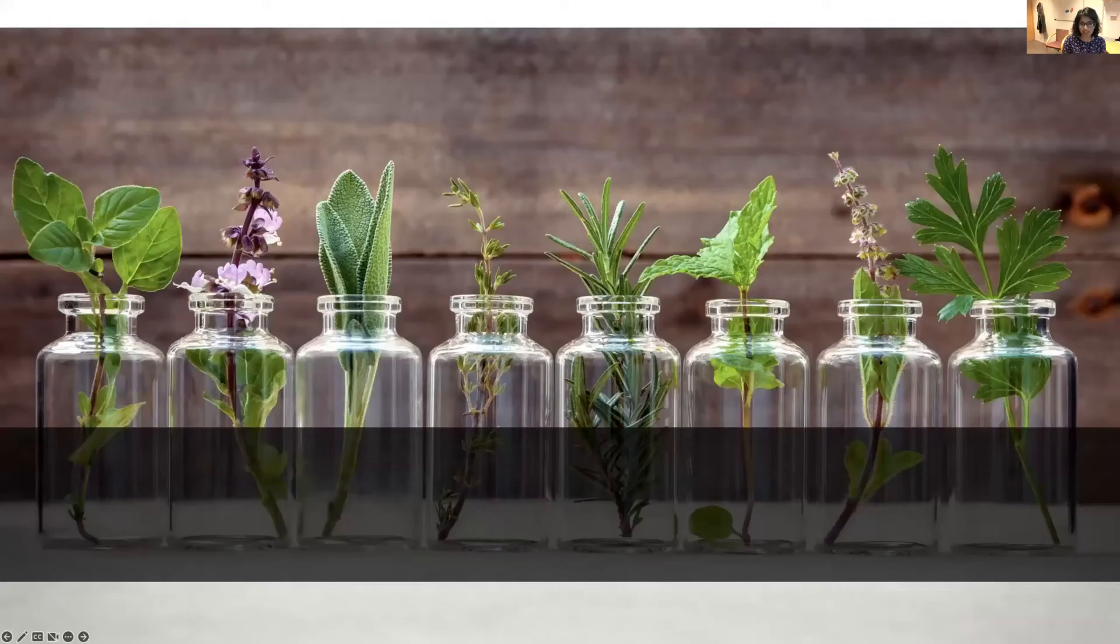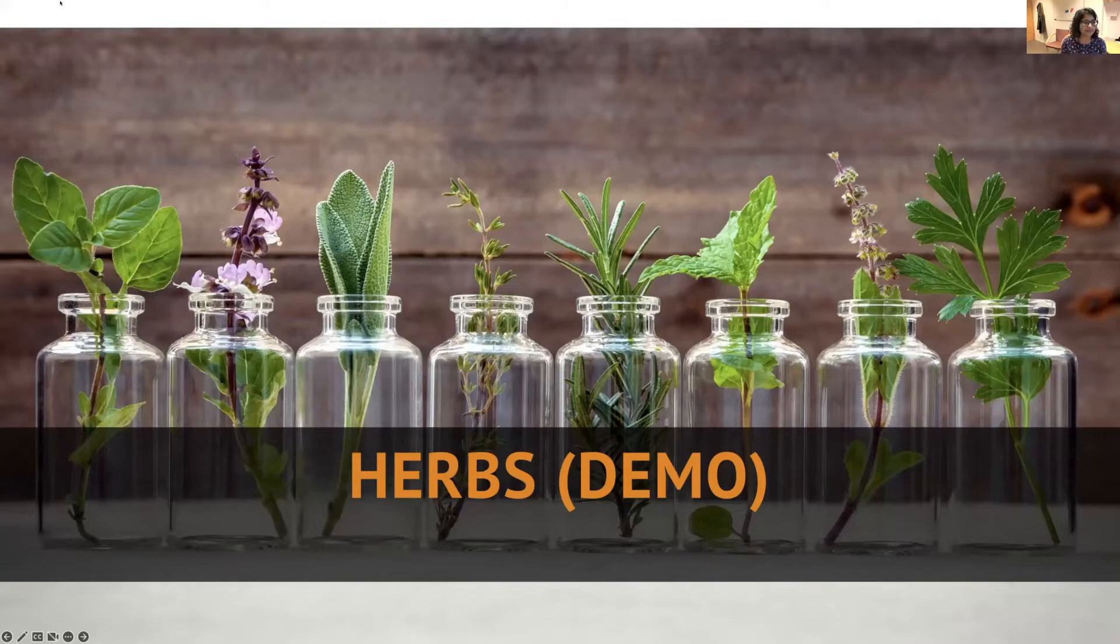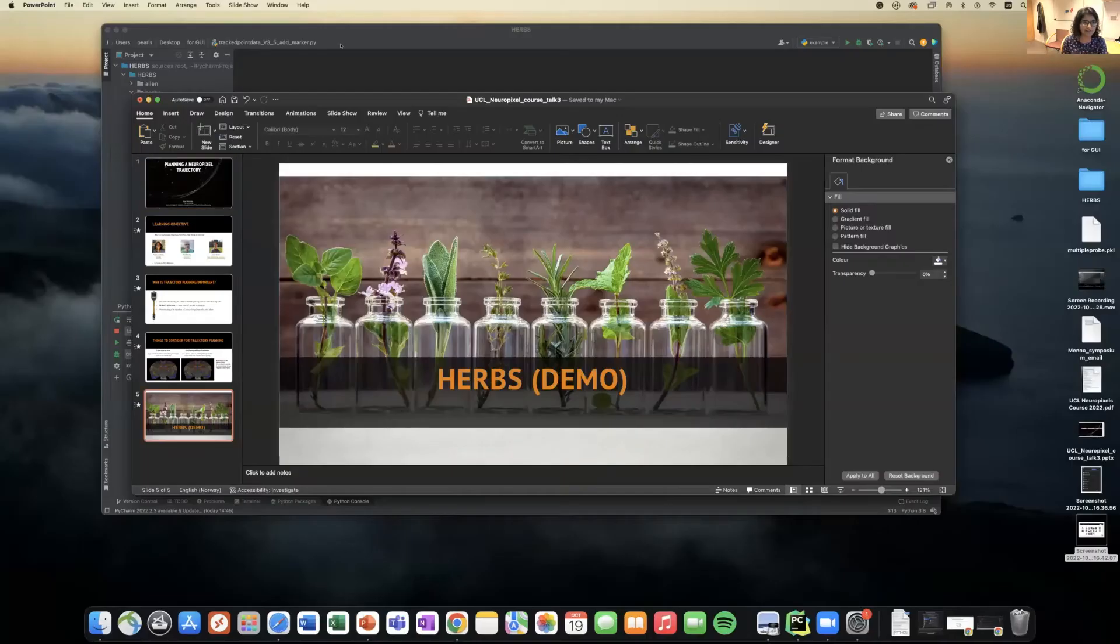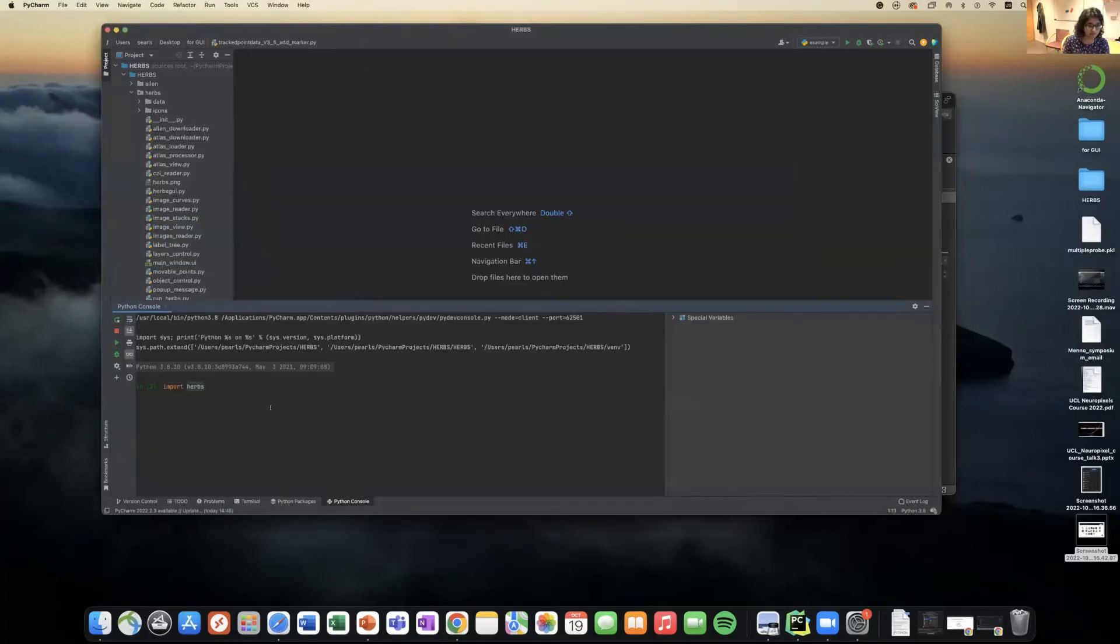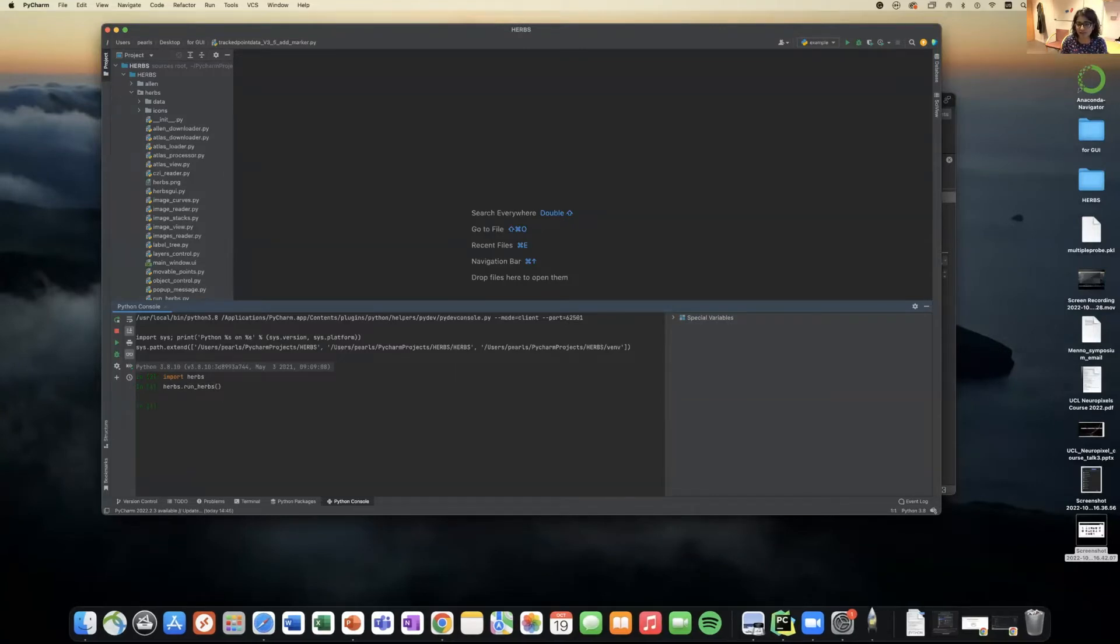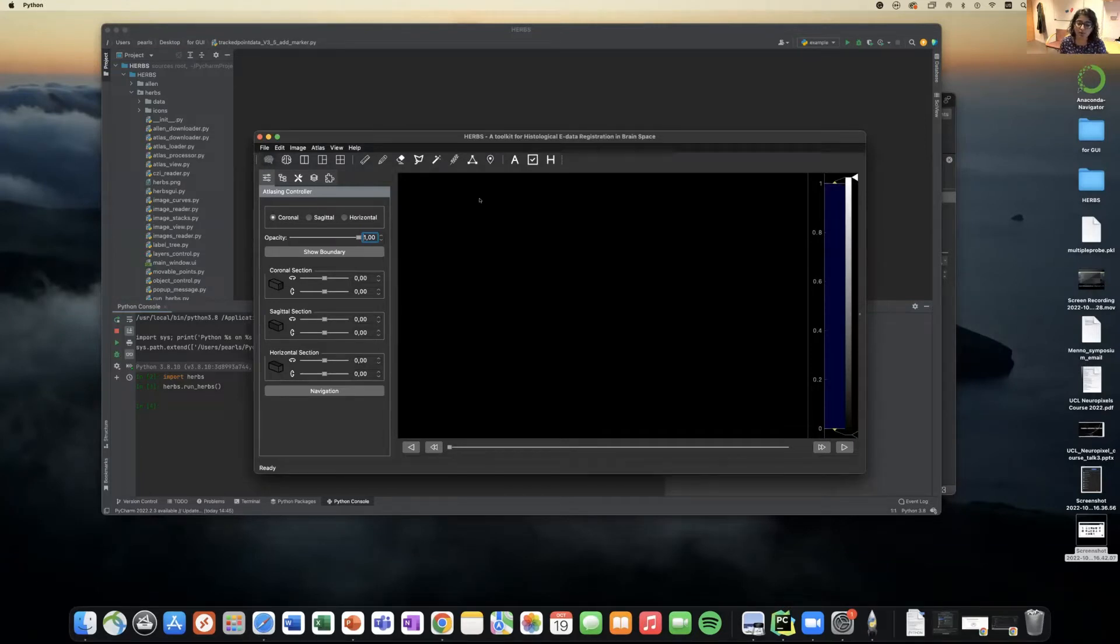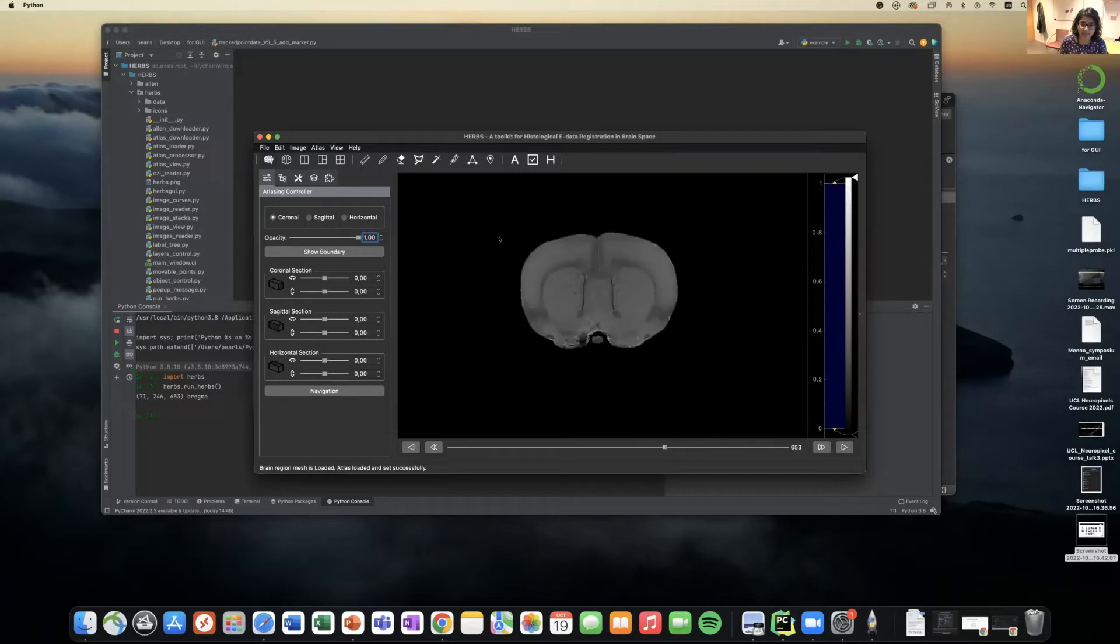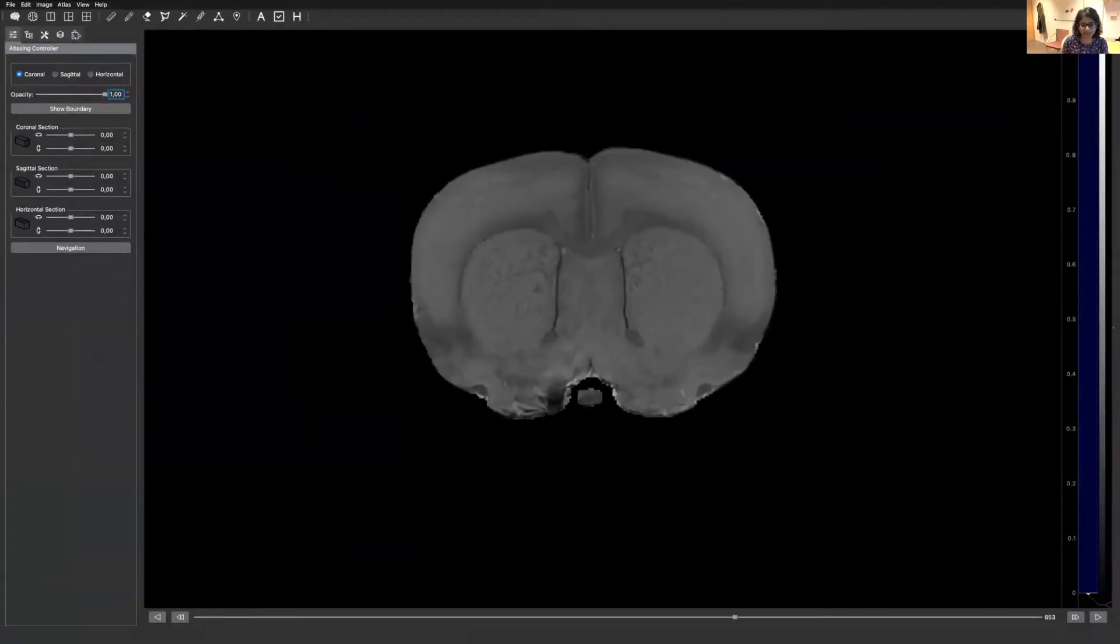So let's move ahead and see how HERBS works. You can find HERBS developed in our group on our group GitHub page. So it is a Python package. You import HERBS, run HERBS, and you have the GUI window open. You can load both the mouse atlas, Allen mouse atlas, or the rat atlas. For this example, let's use the rat atlas.